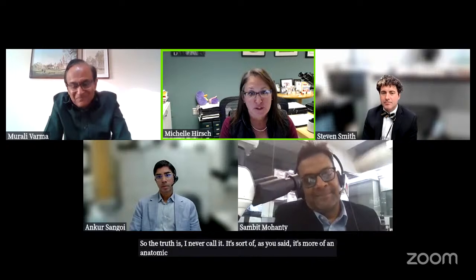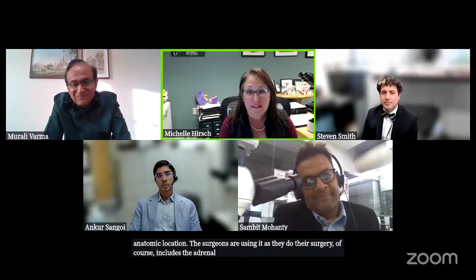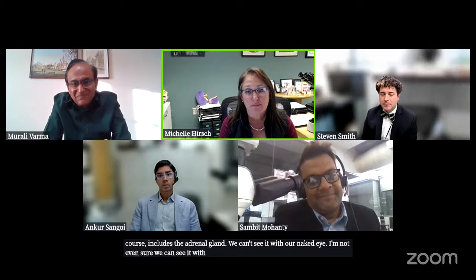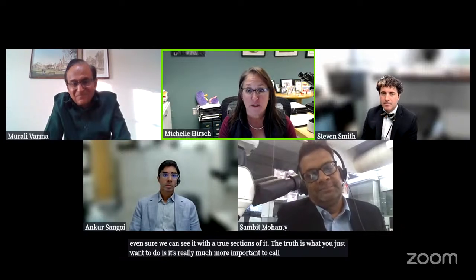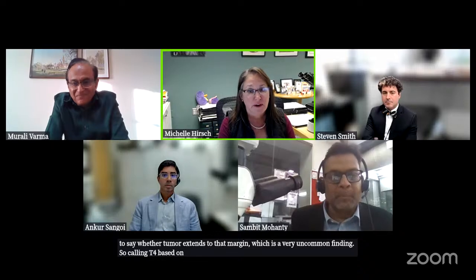I never call it. It's more of an anatomic location. The surgeons are using it as they do their surgery, of course, and it includes the adrenal gland. We can't see it with our naked eye. I'm not even sure we can see it with true sections of it. What you want to do is, it's much more important to call a margin positive. So you ink the outside of the soft tissue, and you say whether tumor extends to that margin, which is a very uncommon finding. So calling T4 based on Gerota's fascia is very, very uncommon.